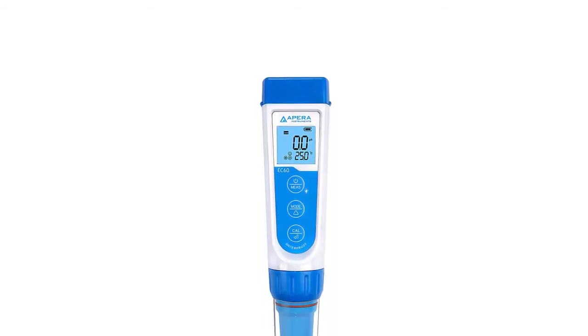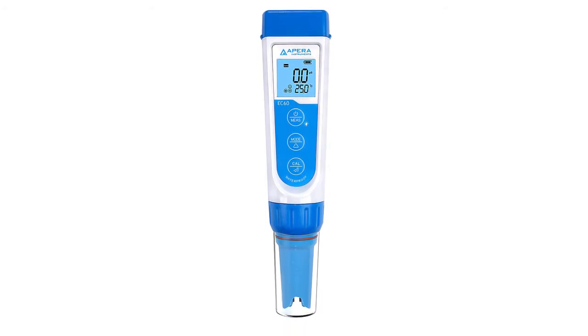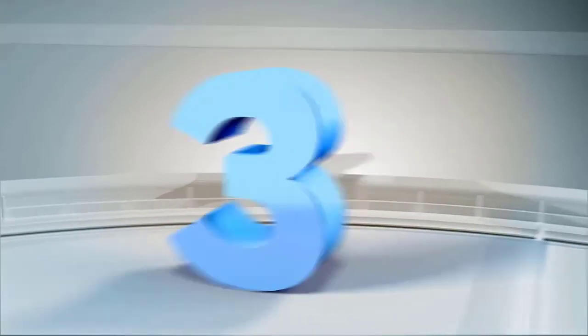The TDS PPM meter will shut off automatically if without operation for over 2 minutes. Test the purity of drinking water to ensure it's healthy, monitor if your Reverse Osmosis (RO) or DI system works properly, check whether a filter needs to be replaced, maintain aquariums, test hydroponics nutrients, pool and spa, and more. It also includes a 90-day warranty.